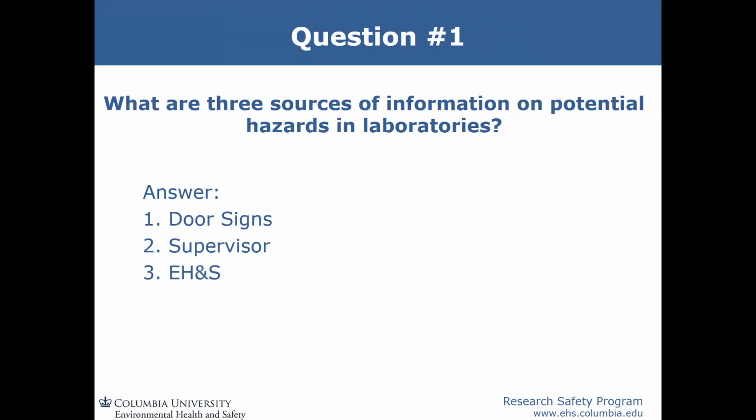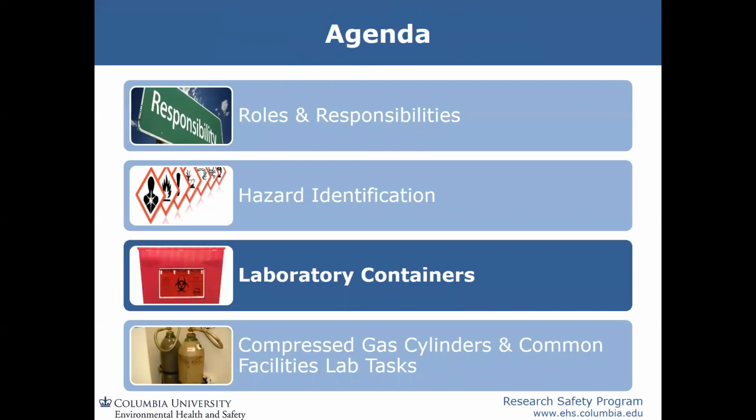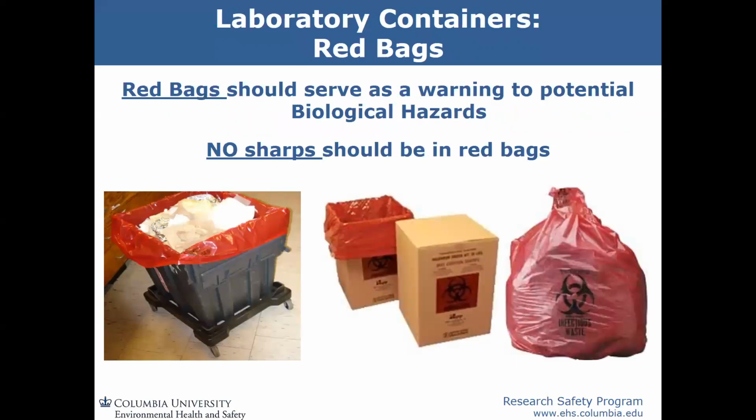The answer is door signs, your supervisor, and environmental health and safety. Okay, so next on our agenda is laboratory containers. The first container we will discuss are red bags.